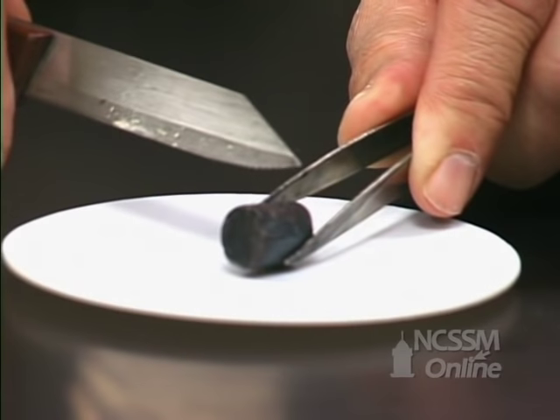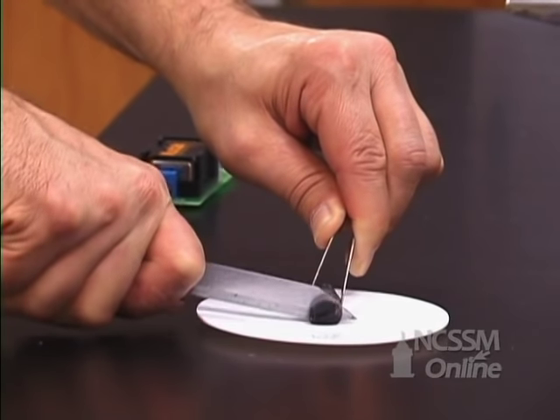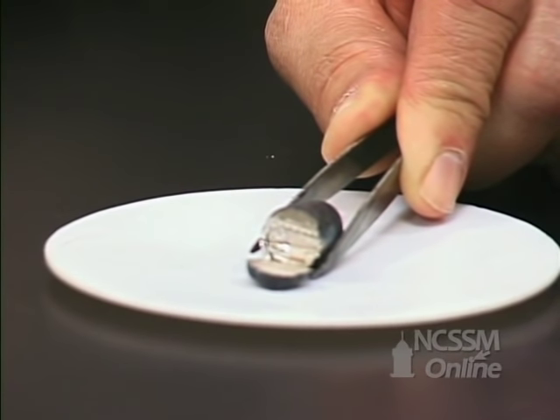Group 1 metals tend to be relatively soft, and we can easily cut the metal with a knife. What we can see is the shiny metallic surface underneath.